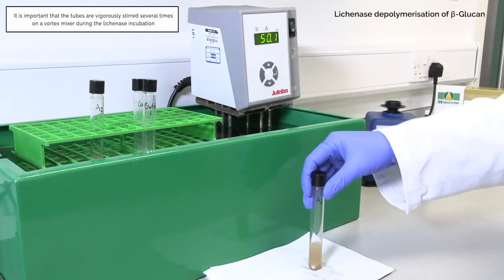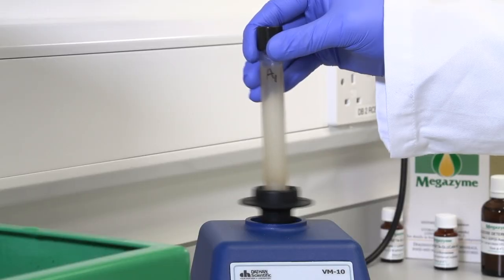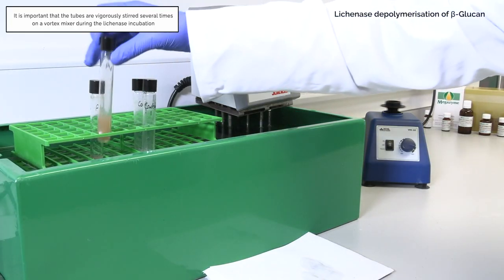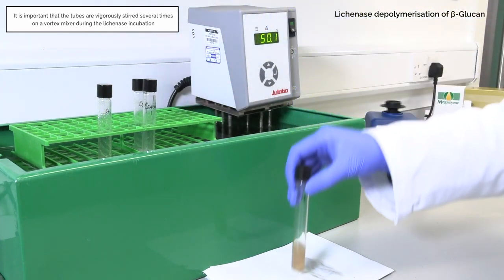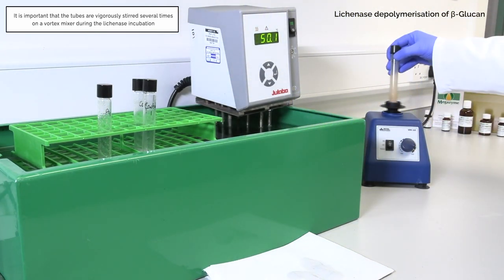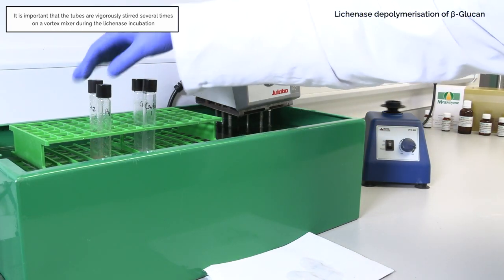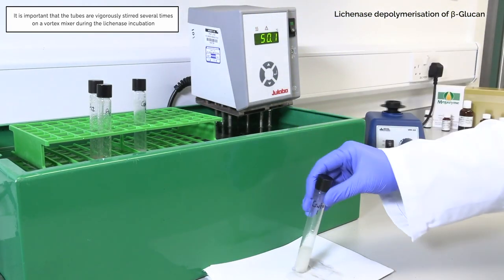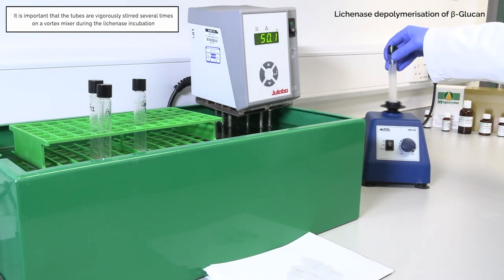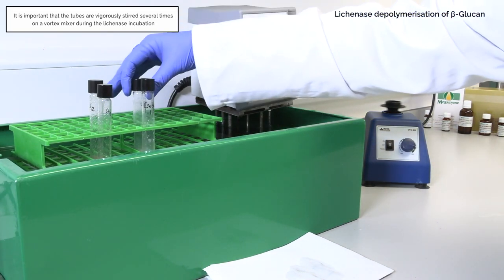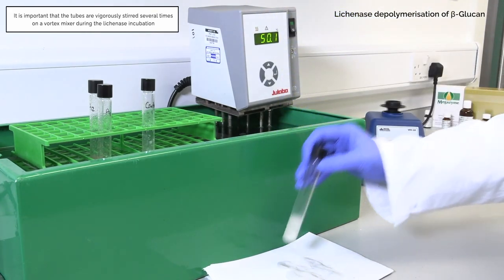For samples which contain a very high level of beta-glucan content, the beta-glucan can form gel particles that stick to the side of the test tube. Therefore, with these samples it is important that the tubes are vigorously stirred several times on a vortex mixer during the lichenase incubation to allow the lichenase enzyme to come in contact with the beta-glucan to break it down into soluble oligosaccharides.